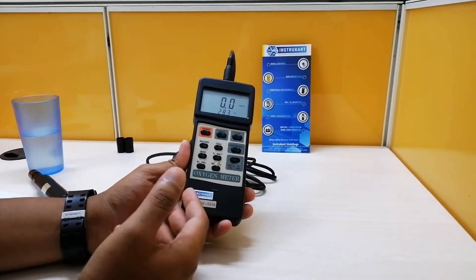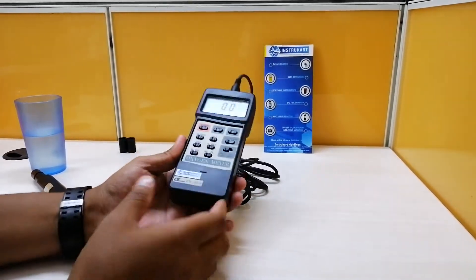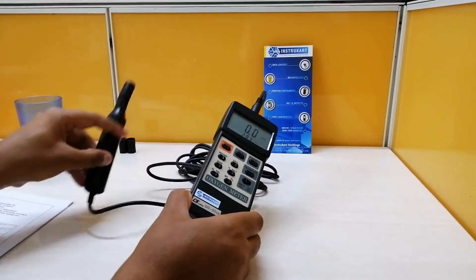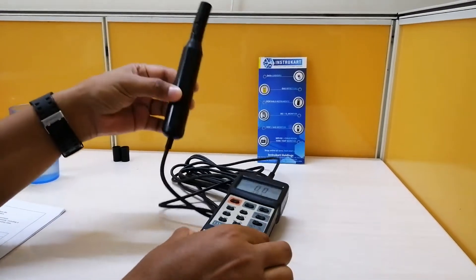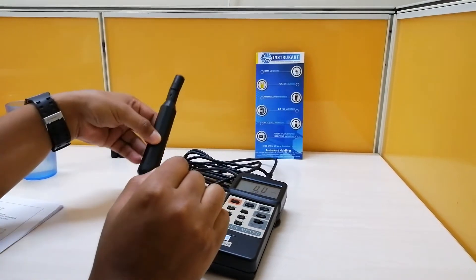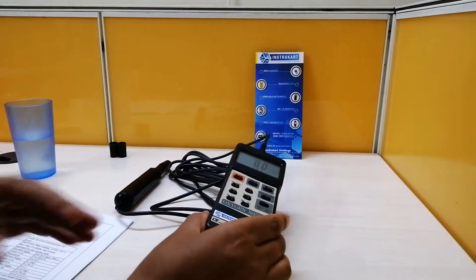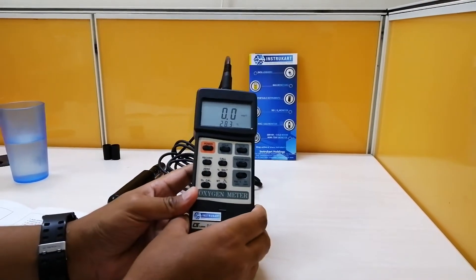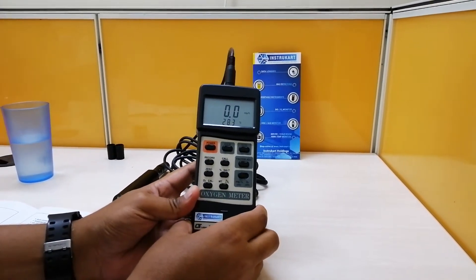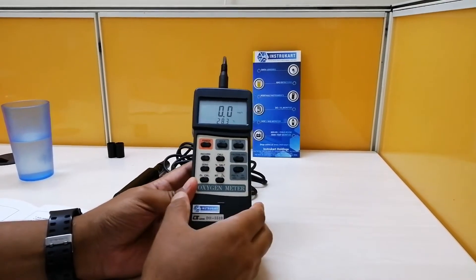Whenever you want to see the oxygen in air and dissolved oxygen in water, we have only one probe which is used for capturing both DO and oxygen in air. I'll demonstrate that in a while. Coming to the basic features, it has a polarographic type oxygen probe which helps this instrument give precise readings.